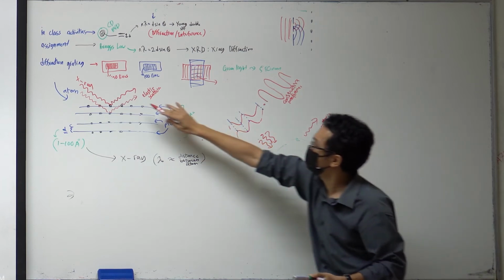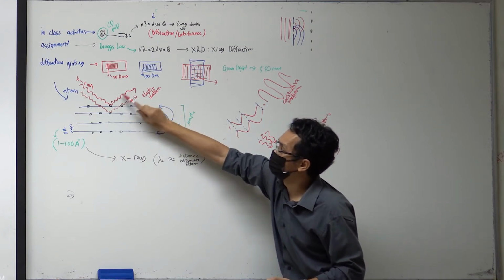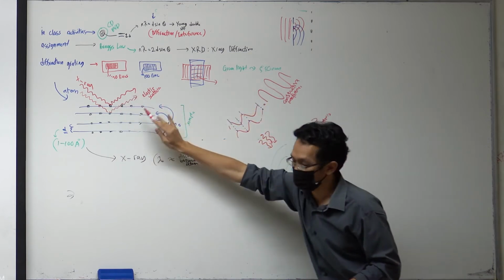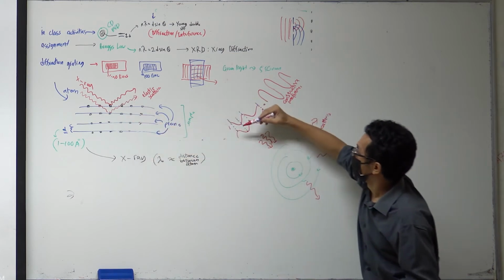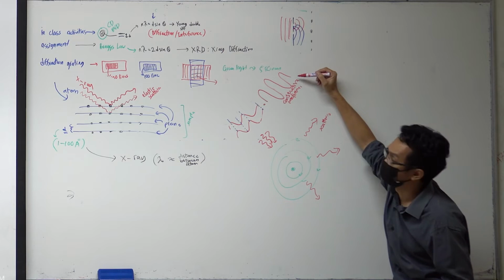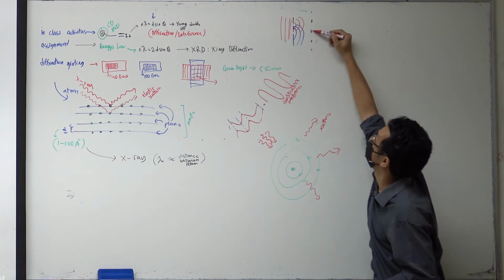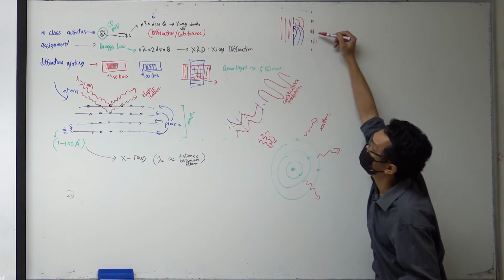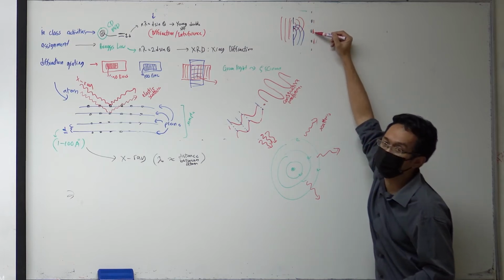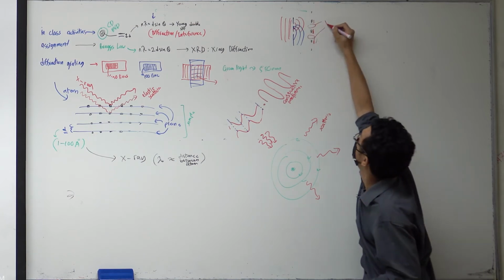And when it scatters, it can become like this, meaning that the two X-rays, or in reality many X-rays, are in phase with each other, and then you get this big constructive interference. Similar idea with this. The bright light that you see is a constructive interference in the Young double slit. The no-light region here means that this is destructive.